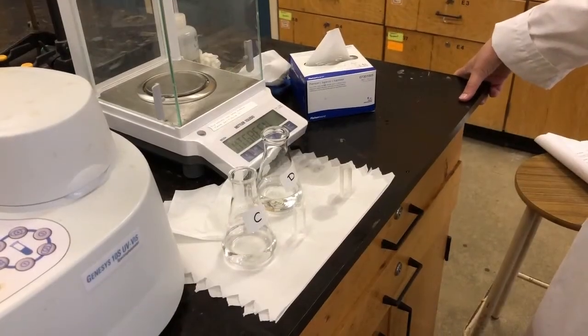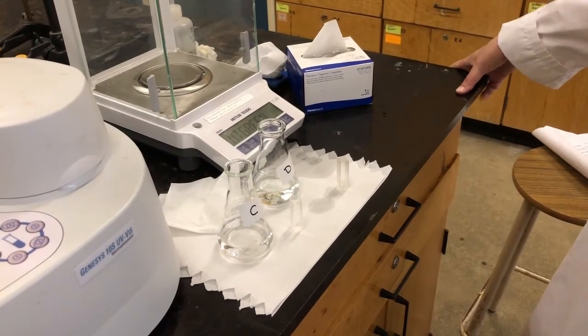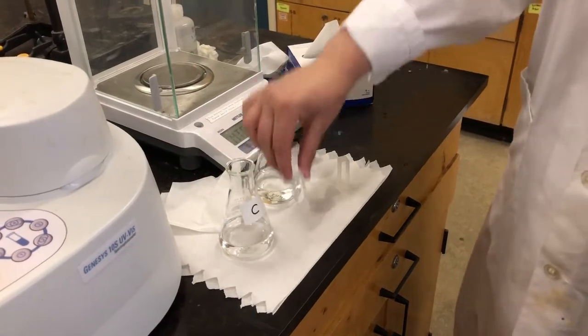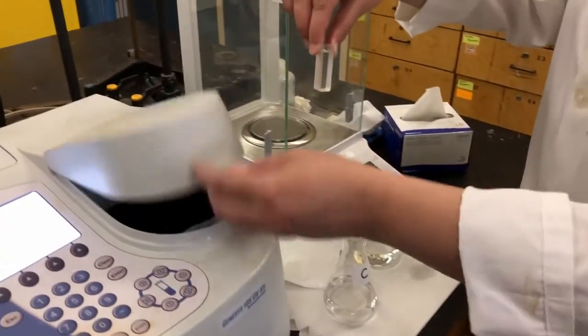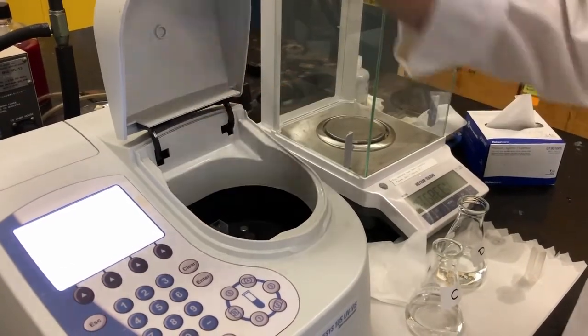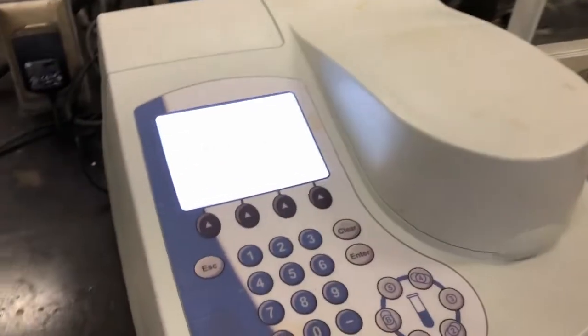Okay, so now that we have our standards all measured, we can start with the samples. So we have two samples for nitrate, C and D. So I'm going to start with sample C. I already have it measured out into the cuvette. And again, we're going to do the same thing here where we measure at 275 and at 220 nanometers.